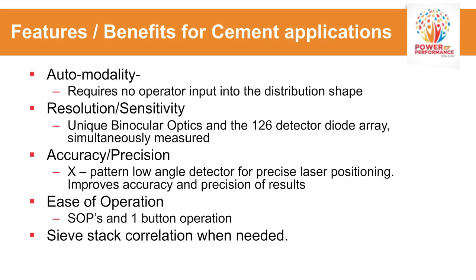And positioning and aligning of that system is extremely important. And we have this, I'll show a picture of it later, an X-pattern low angle detector that allows us to position and hold about a 1 micron tolerance on positioning that laser beam. And this gets us the very accurate and very precise results, so we can get good precision as well as very accurate results.